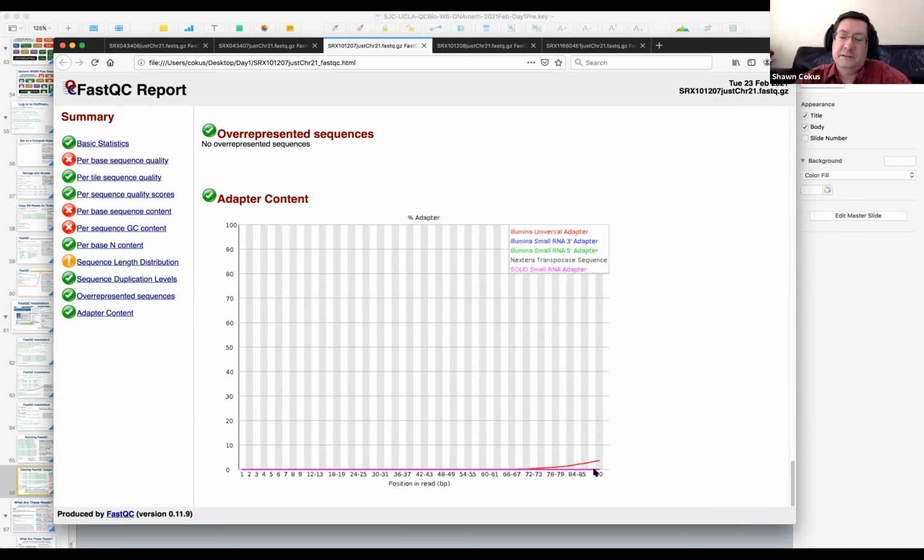And so that's it. If we wanted to deal with variable length reads, we could run a program like cutadapt to recognize that Illumina universal adapter and variably cut from where it starts to the end. A simpler approach, which is what I'll take in the workshop just for simplicity, is we'll just cut. We're just going to kill the bases from 70 something on. They're not very high here, and towards the end, it's 5%. It's not crazy, but anyway, we'll just take a subset of cycles to deal with the problem.